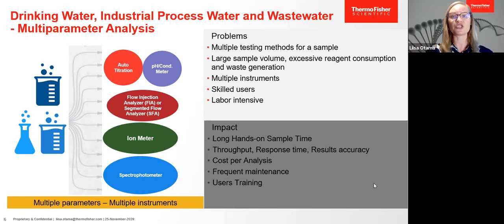If your instrument is down due to maintenance, you might even have to send the samples someplace else to be tested, or just wait for the results to come after the maintenance. And of course, maintaining the user skills and training is probably something that you want to reduce.